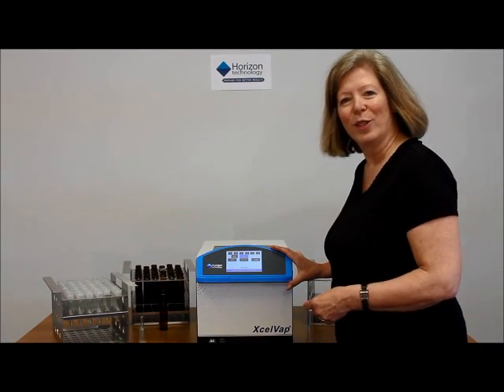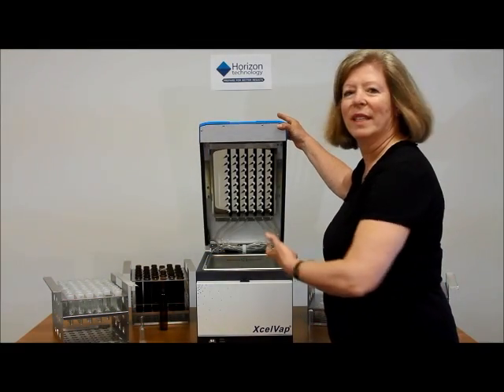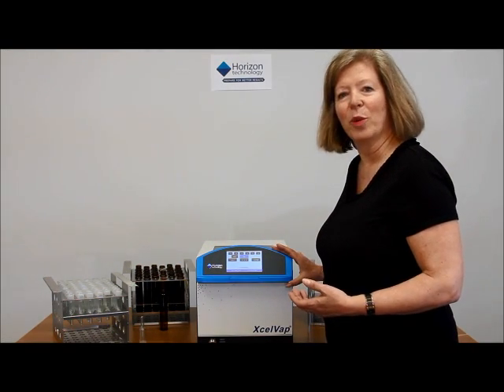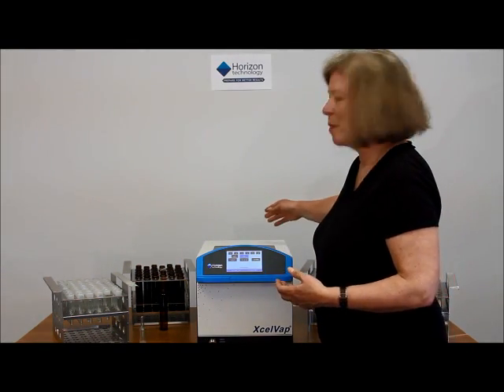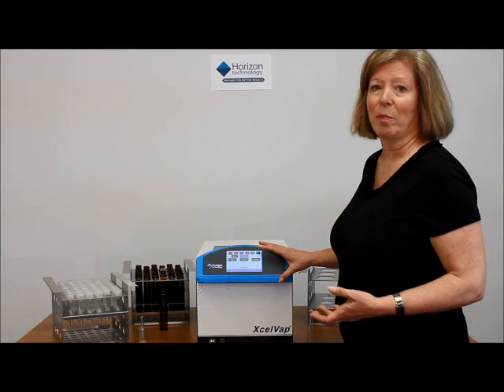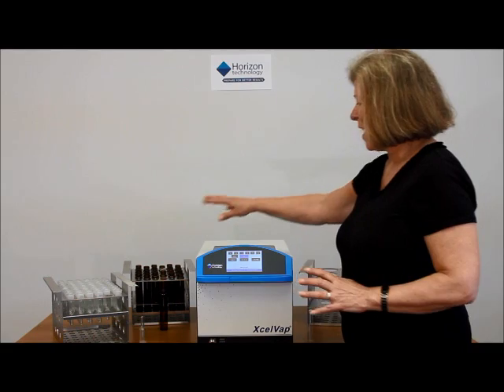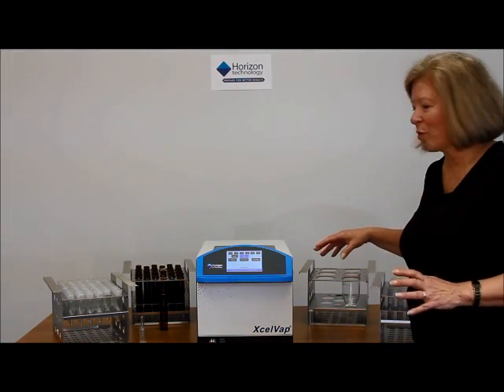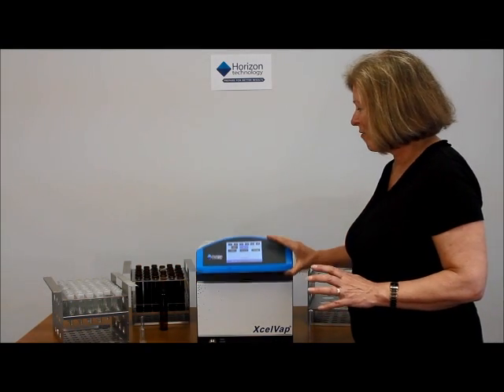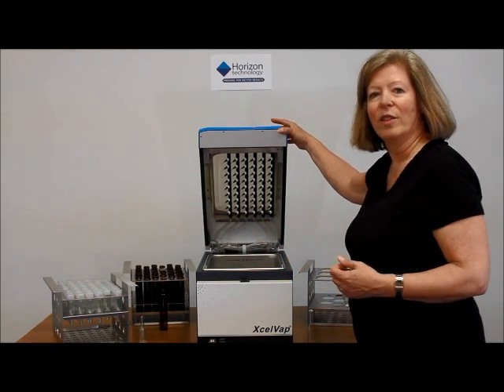Let's start the tour. The ExcelVap is oriented in a portrait direction, so when you open the lid, you can see it opens this way. You don't have to put the system into a hood — there is an exhaust on the back which you can vent to the hood, or if you choose to put it into the hood, it will take up less space. You'll notice a variety of racks with different sized glassware around the one ExcelVap, and that's because you can reconfigure the nozzles yourself to accommodate those different racks.